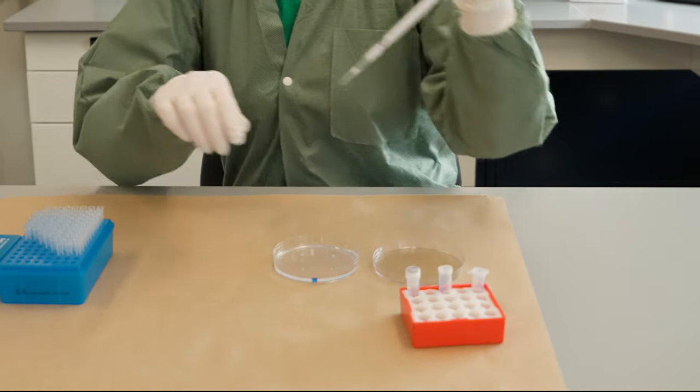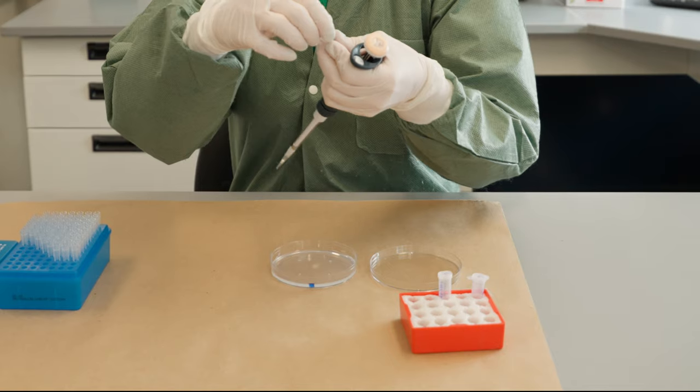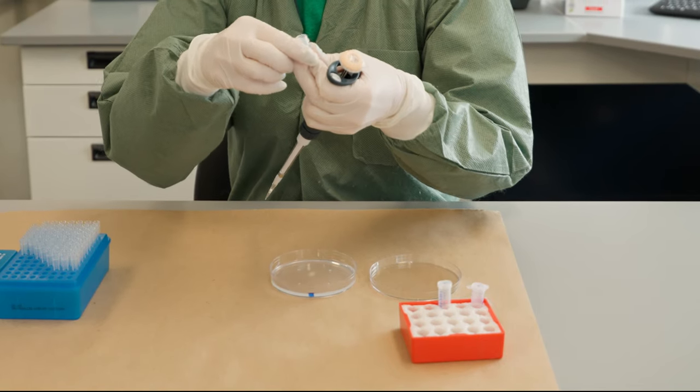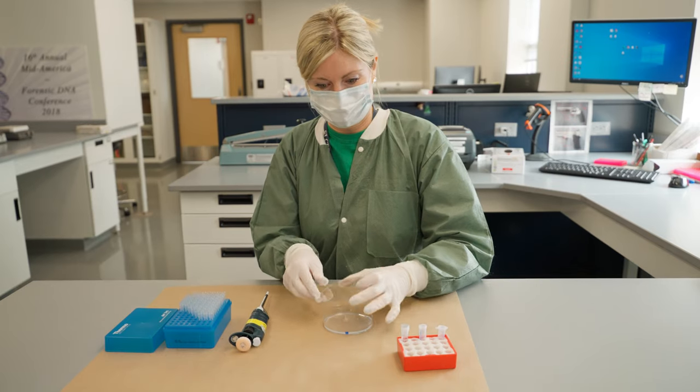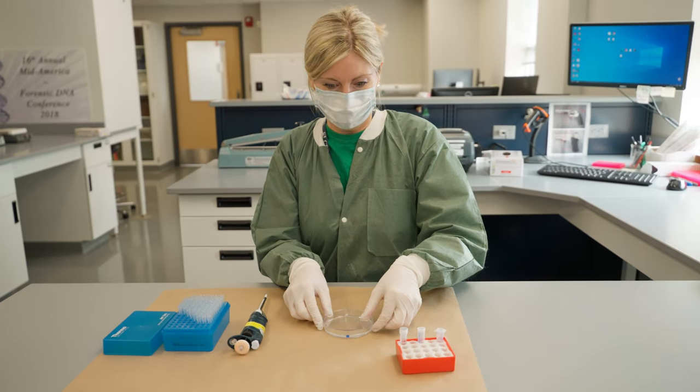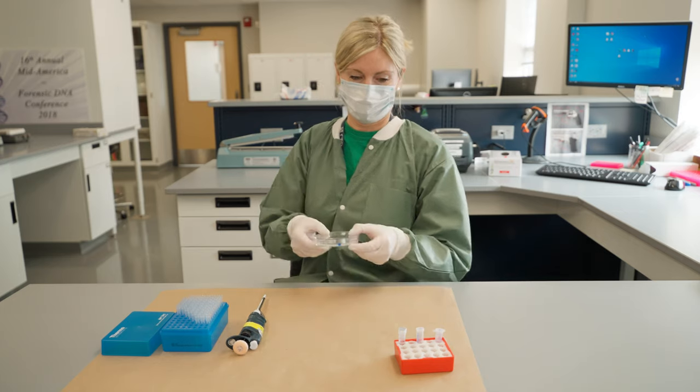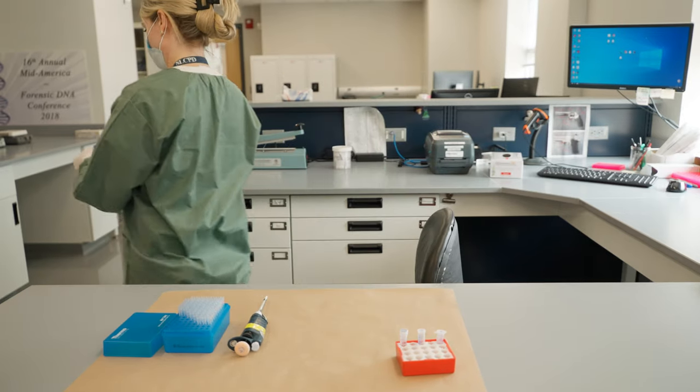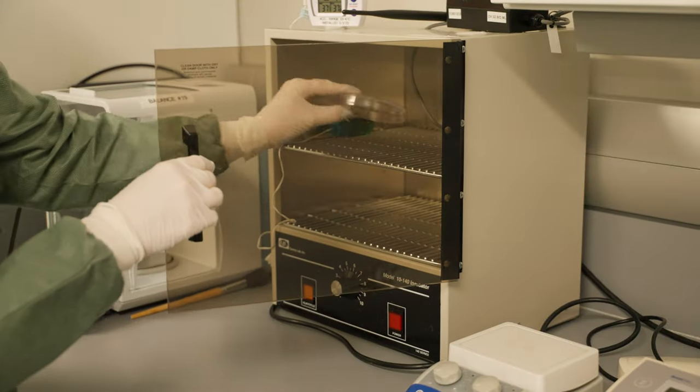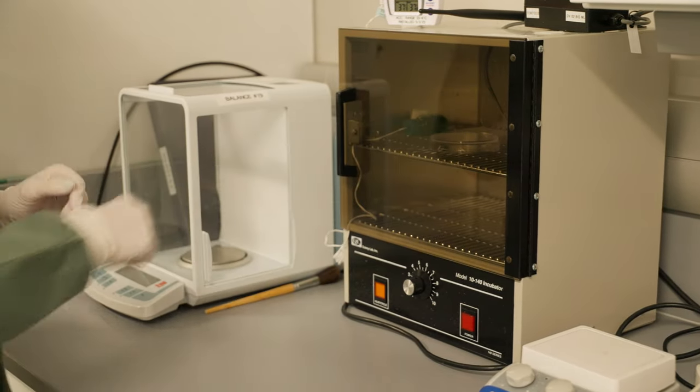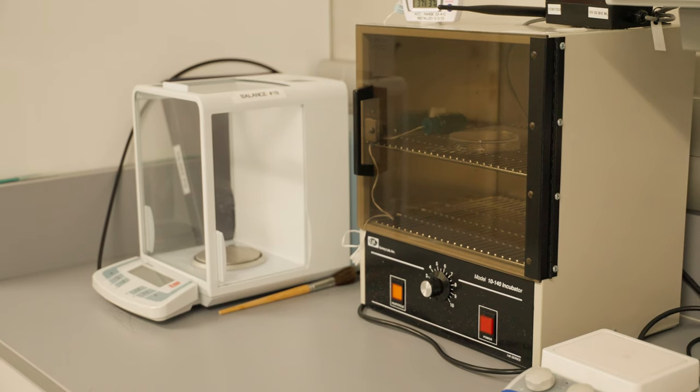Small holes are then punched in a gel plate using a pipette to produce a well, which is approximately 2 millimeters in diameter. The samples are then placed in the wells using a pipette. Each well holds approximately 4 microliters of liquid. The petri dish is then placed inverted in an incubator at approximately 37 degrees celsius for 2 to 6 hours or it can be stored at room temperature overnight.